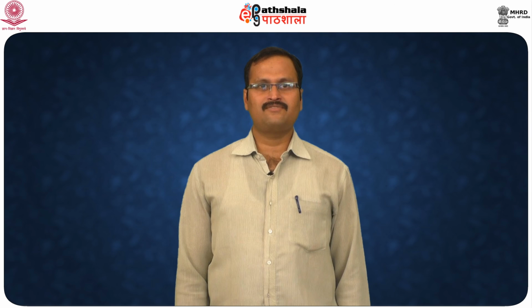Under technical test, this is another broad category. We have seen two tests. One is visual identification test, either through optical microscope or SEM or TEM, in which the morphological structure is identified with distinguished features of every fiber. The next subcategory is the solubility test, under which the solubility of every fiber is unique and through which it is identified.